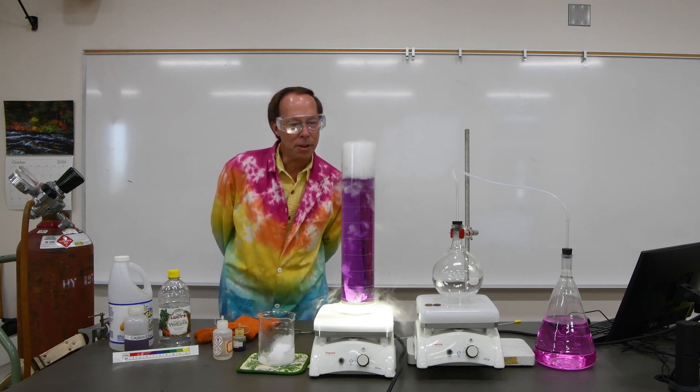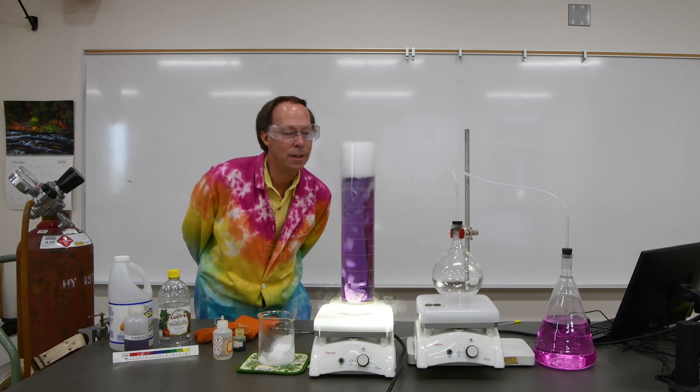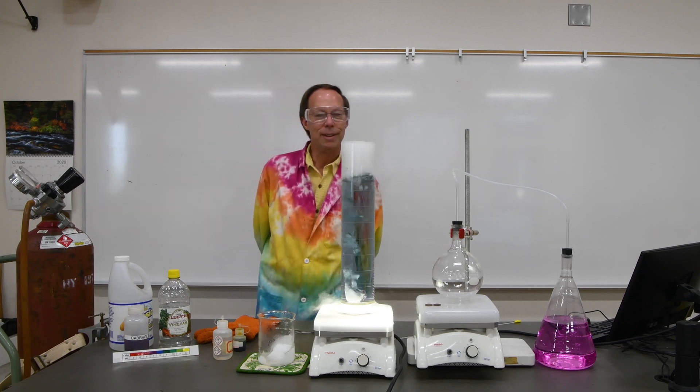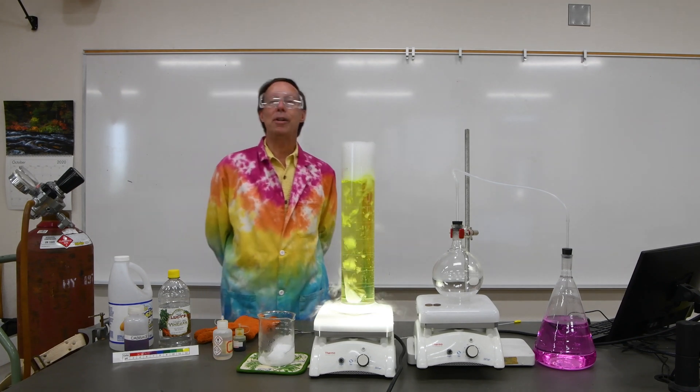Looks like that's already beginning to lighten up a little bit. Now it's moving a little more toward the blue — that's a nice blue color now. Now it's green. I like that green color. And then eventually it turns yellow.